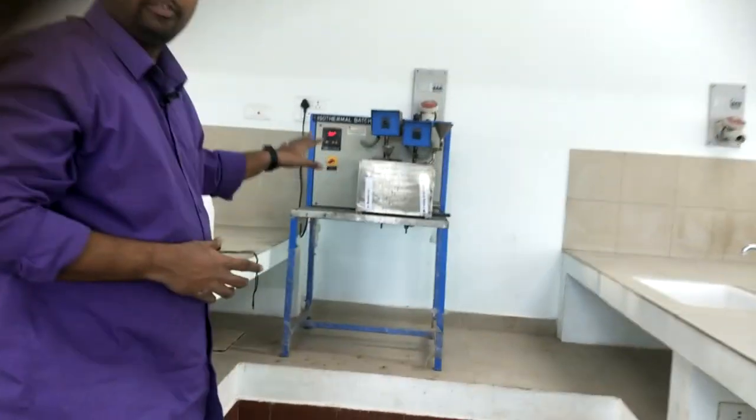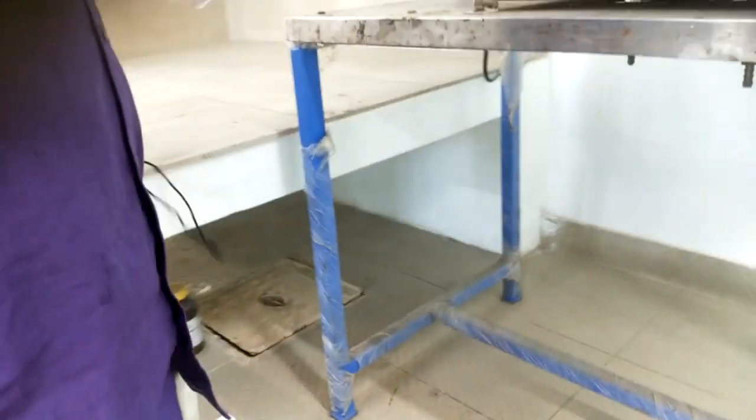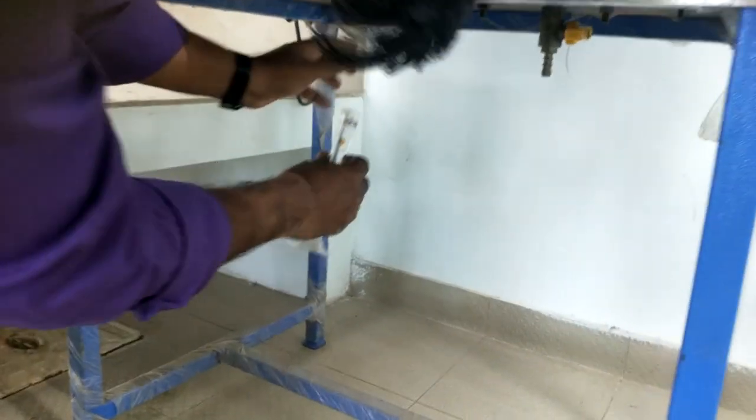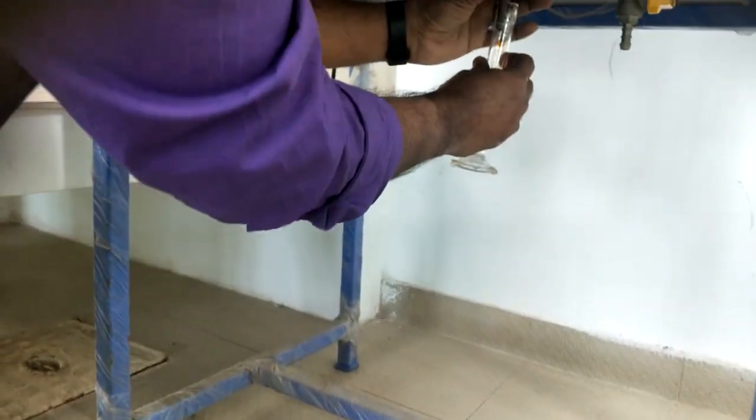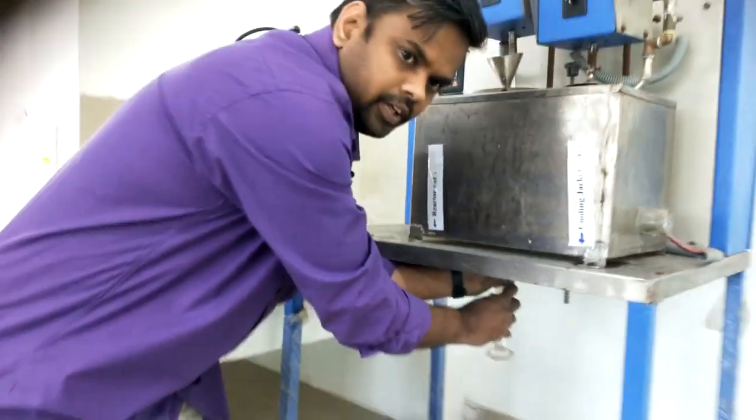So we will withdraw samples every minute. Now 2 minutes are over, so we will open the valve and collect the sample. And we take the sample again.